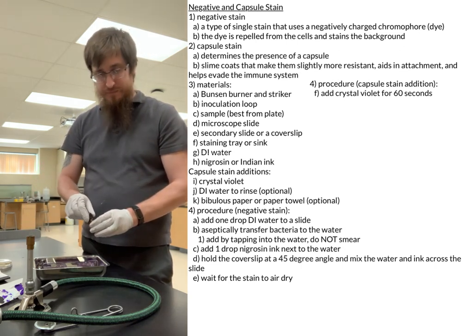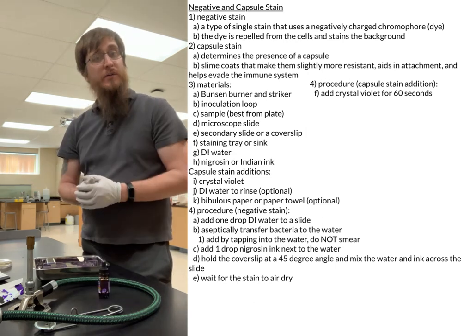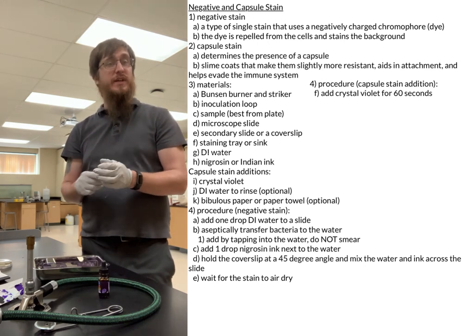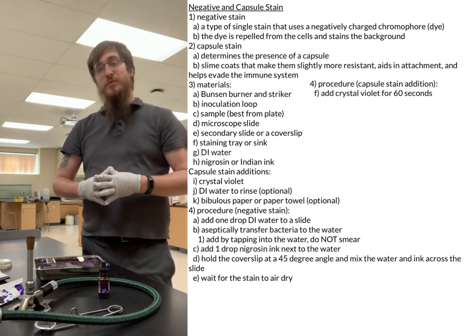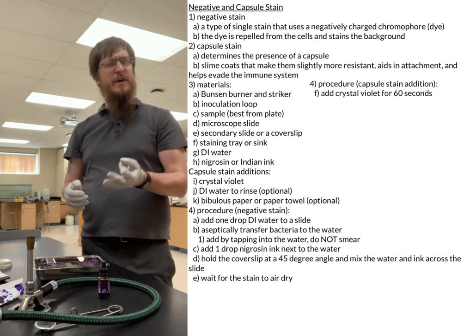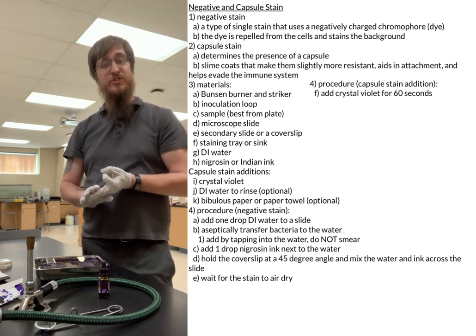There we go. Now I wait 1 minute while my stain is basically soaking into the cells. So I kind of mentioned again in the beginning of the talk here that there are 3 basic ways that you can actually finish up this procedure.